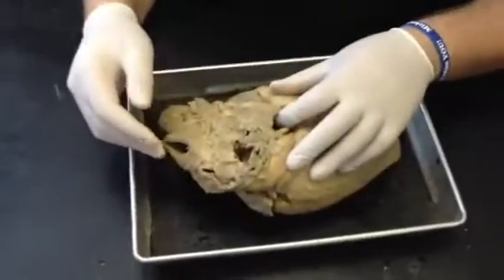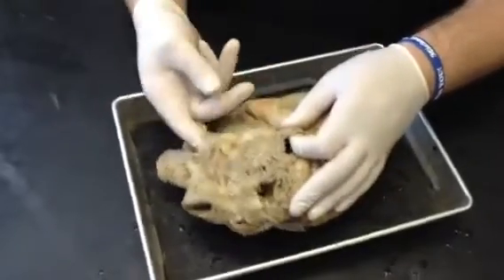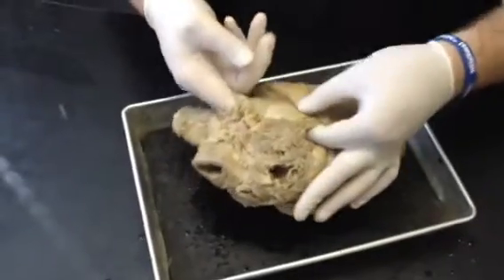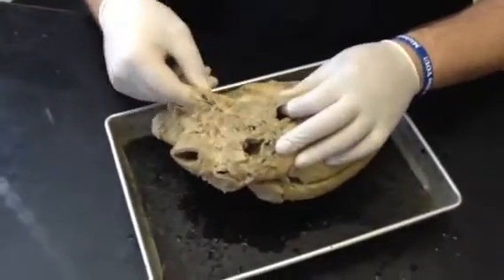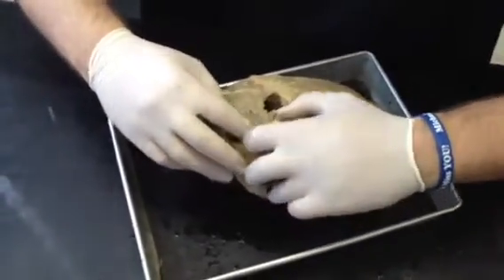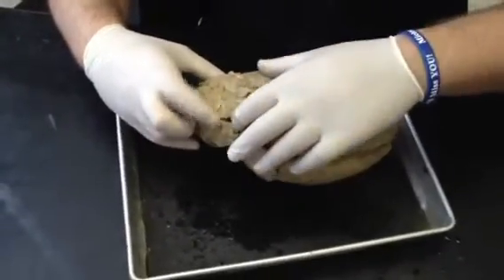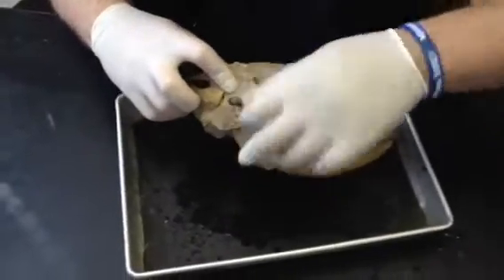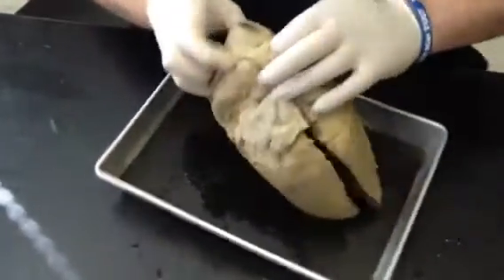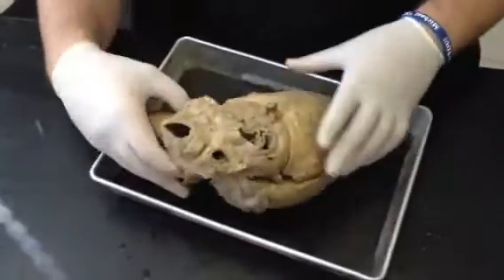If you look posterior here, you see inferior vena cava, superior vena cava. So my finger's actually touching in here. Yeah, the coronary sinus is inside. So inferior, superior vena cava. You have here this is pulmonary vein. Pulmonary veins coming back into the heart from the lungs. Here you have the pulmonary artery. So you can tell this is coming from the pulmonary trunk here. See? So that's leaving the heart, going to the lungs.